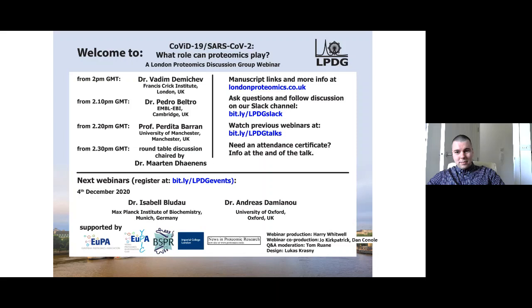I don't really think it's feasible. It's a bit of a delicate instrument, which it's not something which you would routinely use in the clinic. And I think it's not really necessary, because it's an ideal instrument for discovery purposes. When you take a cohort with a disease and you want to find out what's happening, you want to find biomarkers, this is ideally how you would do that, and that's what we've been doing.